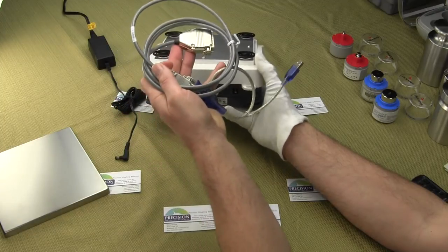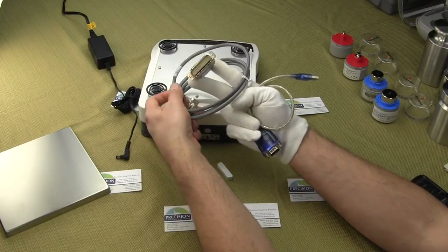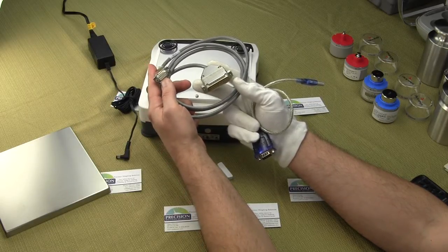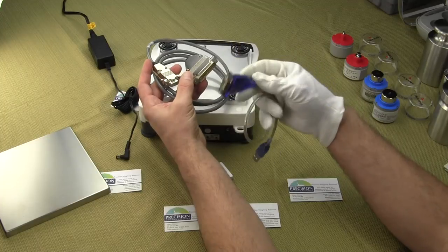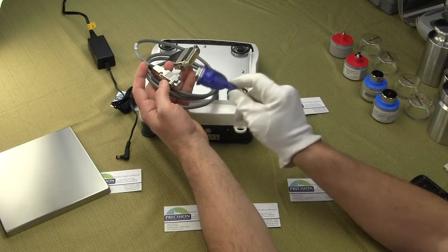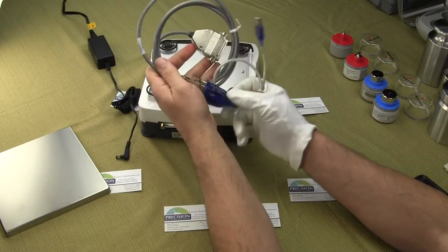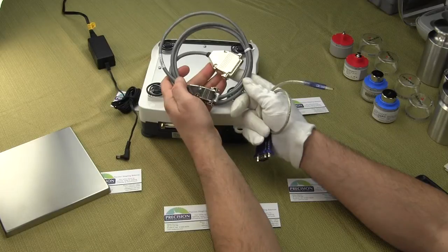You'd have to buy the cable. This is Sartorius' standard cable, RS-232, and you'll notice it's a 25-pin. This connects to the balance; the 9-pin end would go to your computer. Since most computers no longer come with a 9-pin serial interface — they're all USB — we do sell a setup where you go from the RS-232 DB9 and daisy chain it together, plug it in, and now you have USB. You do have to load a driver for it.